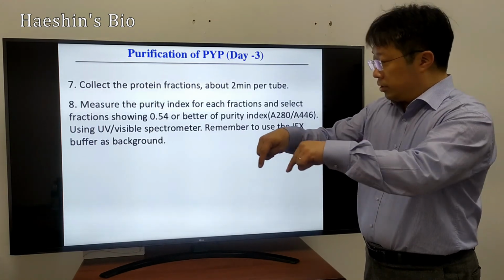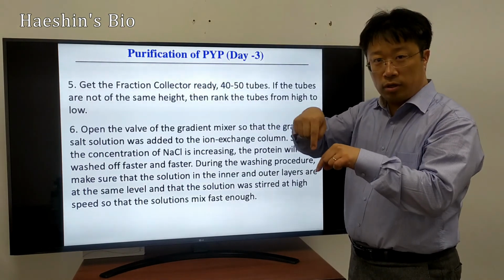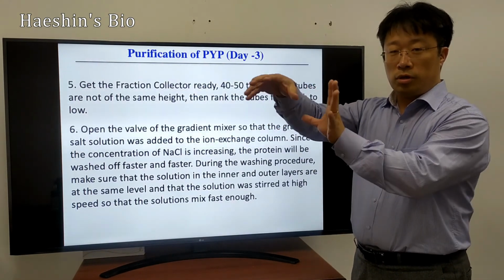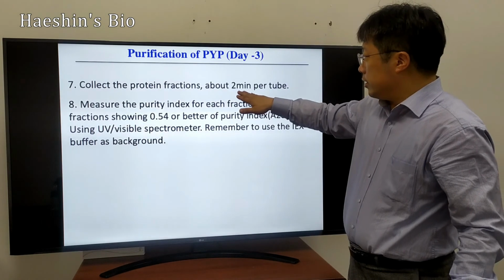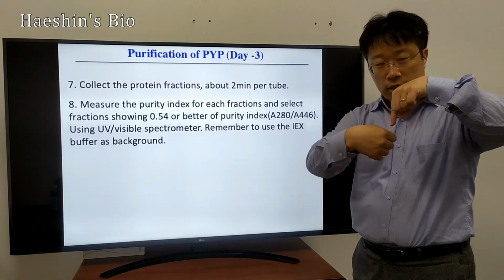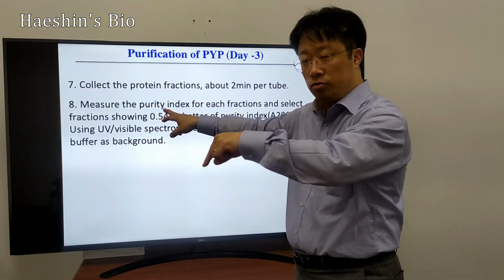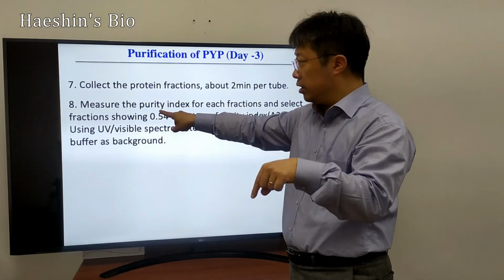So anyway, you have this number of tubes, each tube has a certain amount of solution, and the target protein that we want to purify belongs to some tube in there. In this case we set about 2 minutes per tube. So one tube waits for 2 minutes, and then after 2 minutes they rotate, and the second tube comes. So then after this, among this number of tubes, you check which tube has protein, which in this case is PYP.